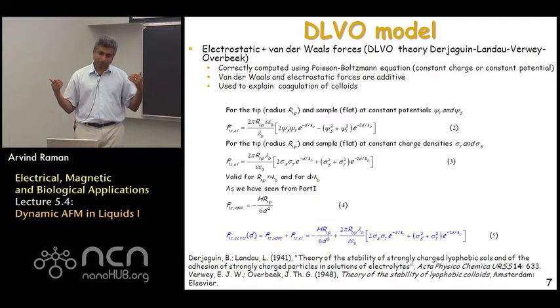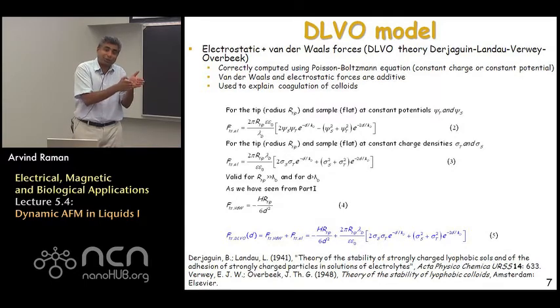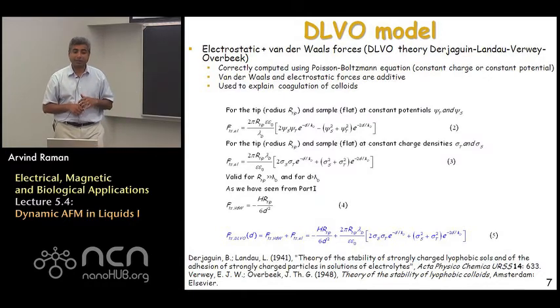And the answer to it has to do with the following observation: as you decrease salt concentration, the electrostatic forces act over a much longer range, and the Debye length is large, and electrostatic forces are generally repulsive, keeping the particles apart. On the other hand, when the Debye length decreases by increasing salt concentration, the repulsion occurs only at very short distances, at which distance the van der Waals forces become active, and they can suck the particles together. So this whole notion of DLVO forces was first developed for understanding colloidal stability, but it's fortunate that we can use the same ideas to understand AFM in liquids.